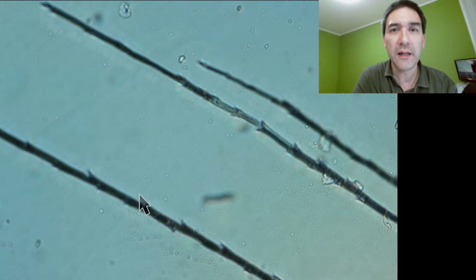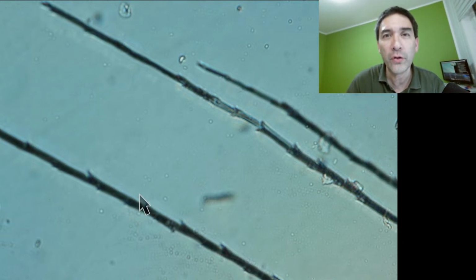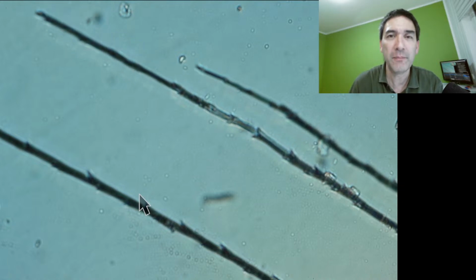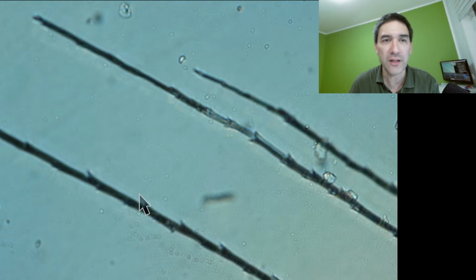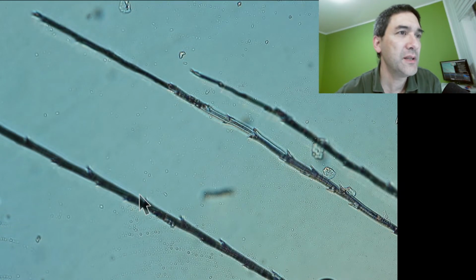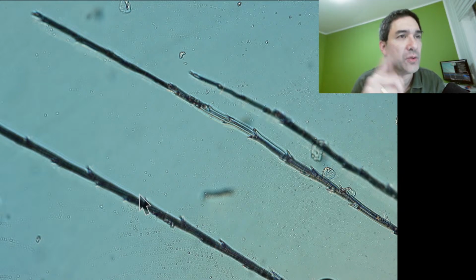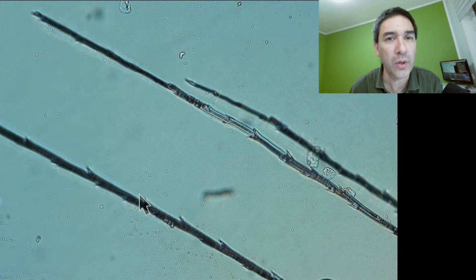I connected it over HDMI through an HDMI to USB converter, and then I put it into the computer. So that's essentially how you're getting the picture right now. You can see that sometimes those fibers are moving a little bit because they're absorbing the water.